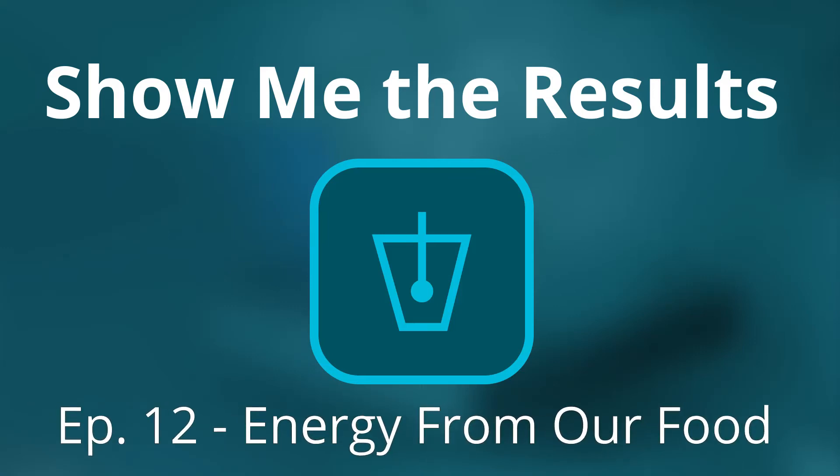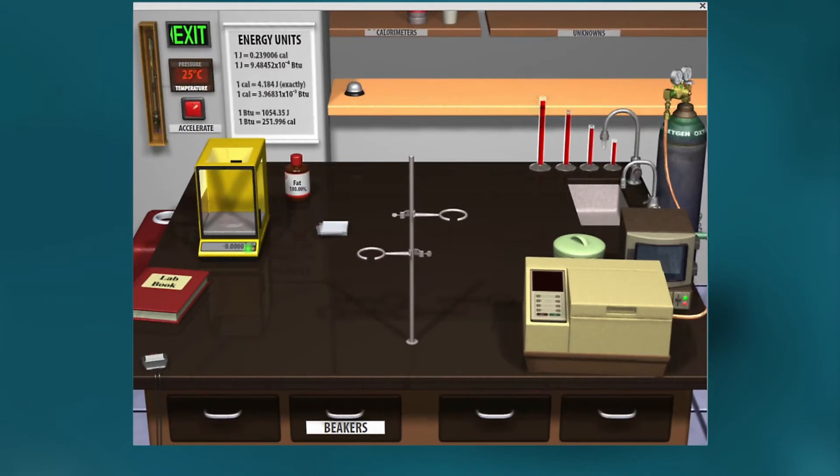Hi, this is Heather. Welcome to another episode of Show Me the Results. In this episode we're in the calorimetry lab and we're going to look at whether we get more energy from burning fat or burning sugar.